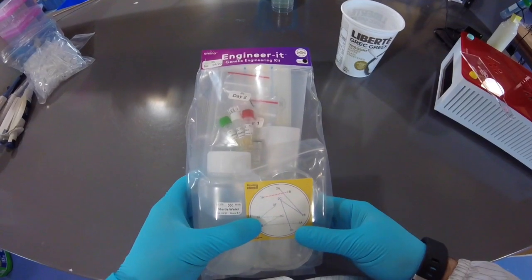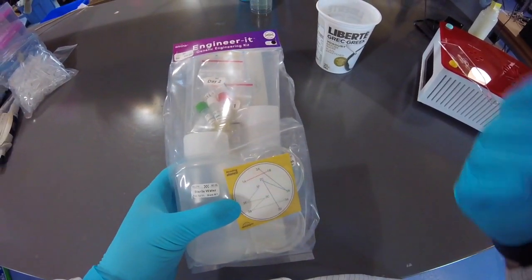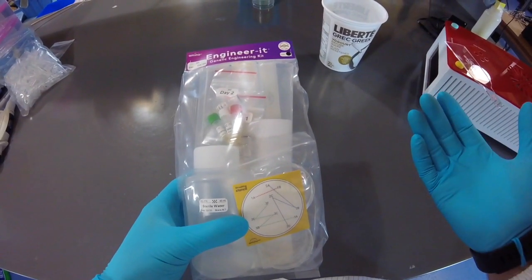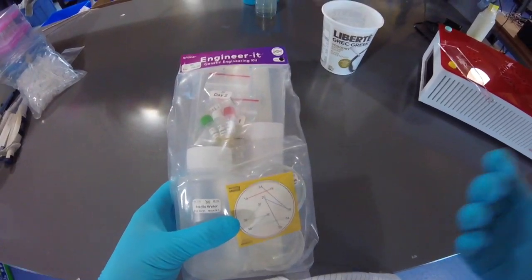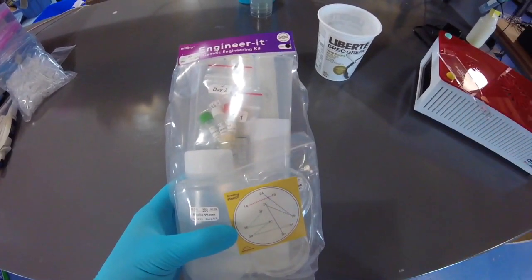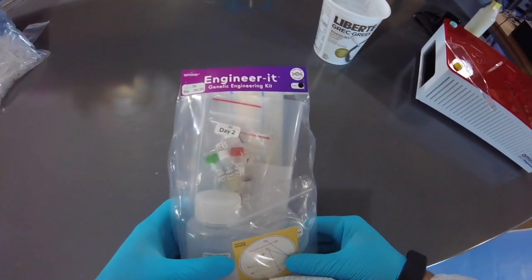On day two, we will collect some of those cells and we will actually go through the process of engineering them. And we'll get to a step that we call the recovery step, where after you've engineered them, you need to bring them back to life and get them growing and loving life again.